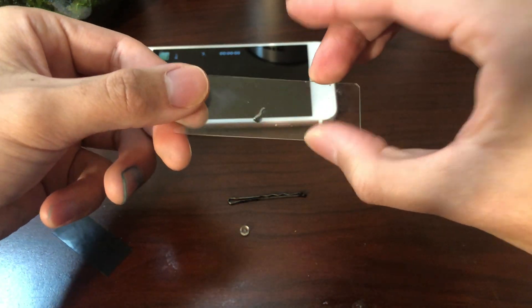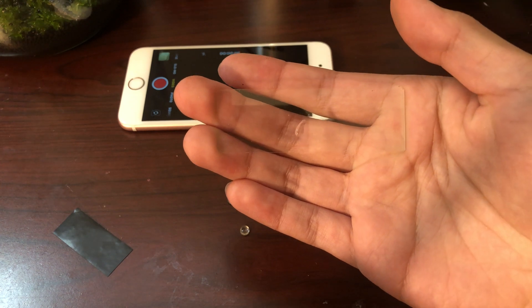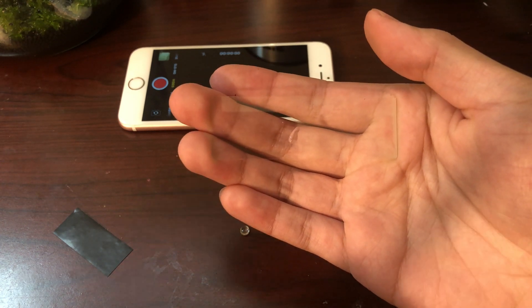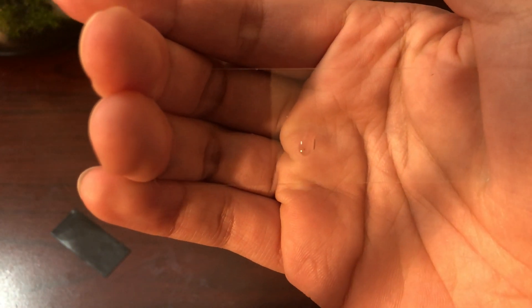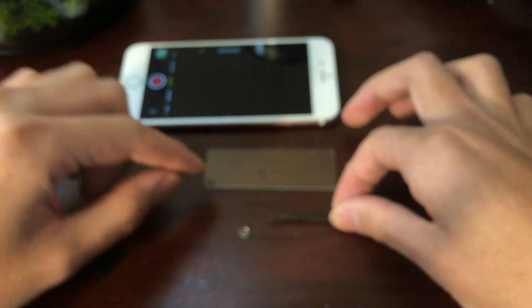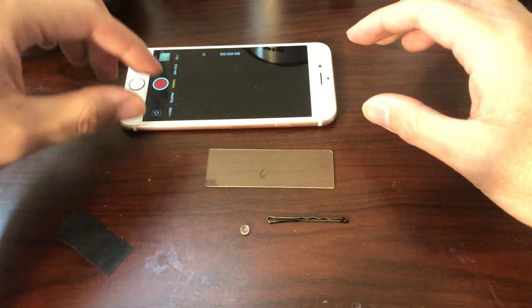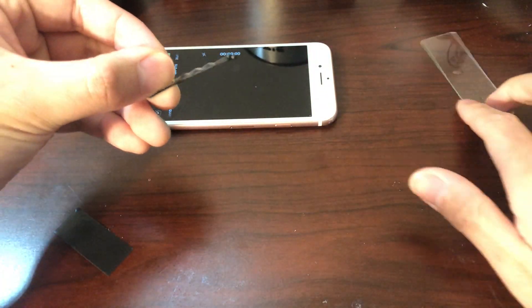So let's get started. You can use this to look at anything under the microscope about one or two centimeters or less. Looking here we have this little black dot — this is a little baby Amano shrimp stage one, and I'm going to show you that it's really really easy to see it under this microscope. Let's go ahead and start building it.